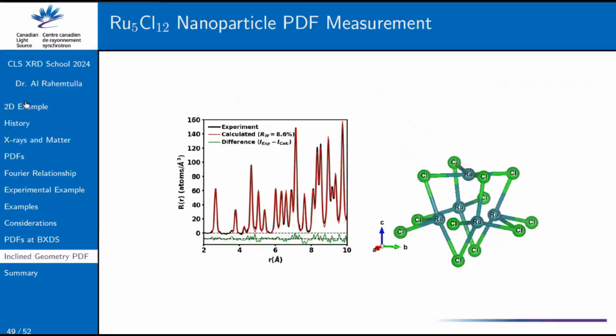I don't have figures of that because that was one of the last measurements we took before the beam dump, so we're still processing and interpreting it. But there's a lot of power behind this once you can get over the hump of the setup and computational work. It's almost the perfect compromise between those 12-hour measurements that happened in the 80s and the quick 1-second measurements that we can do now.